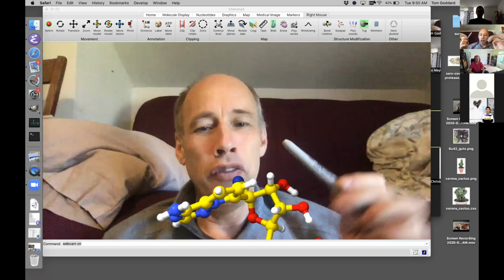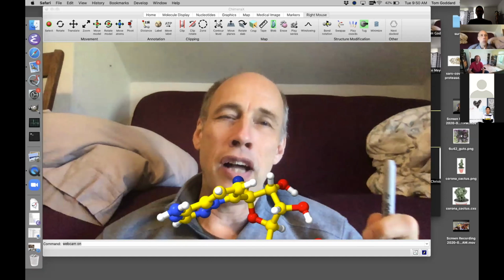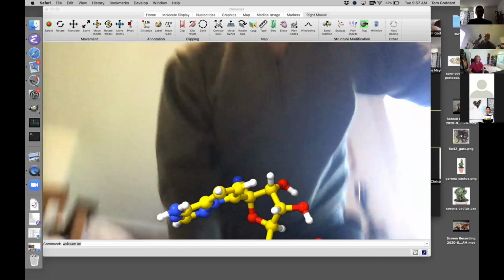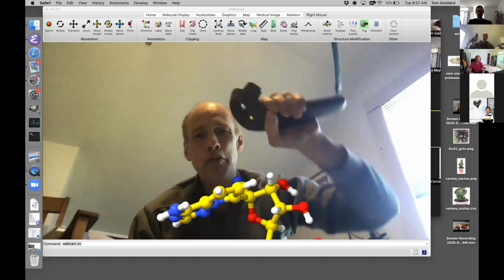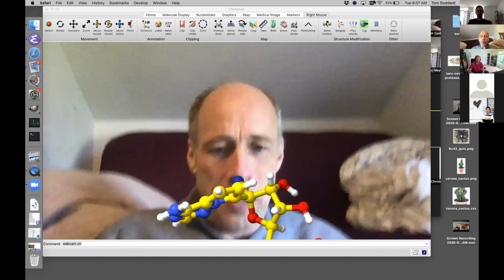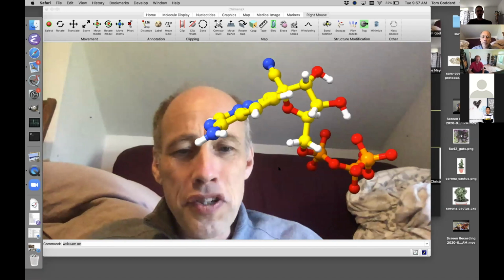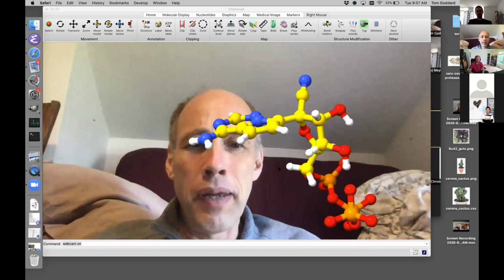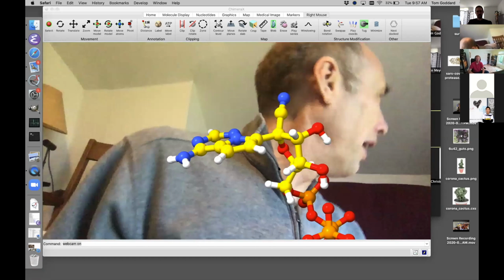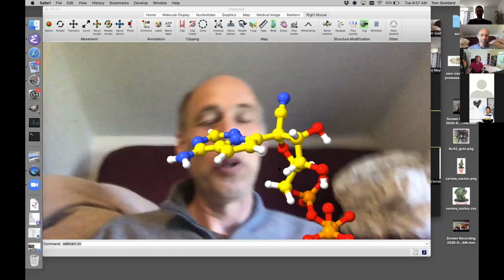VR has different aspects of it that are valuable. One is that I can just have hand controllers, and there's 6 degrees of freedom, unlike the mouse. Like when I was doing this, moving this around with the webcam version of the AR, I'm using the trackpad with one hand while I'm pointing. Where'd my pointer go? Pointing with the other hand. I lost my valuable green pen now.